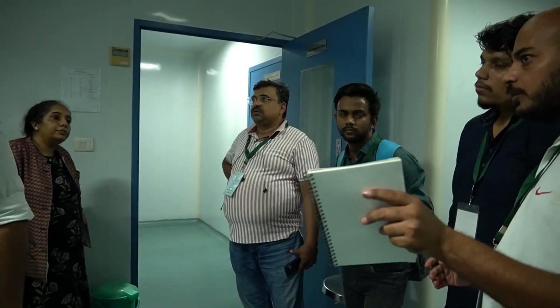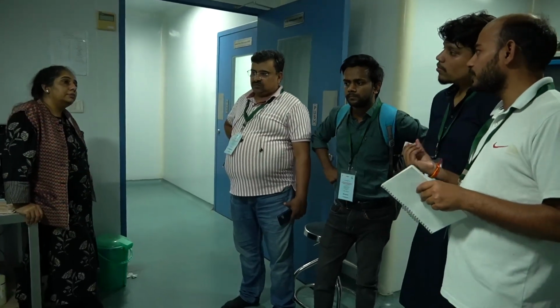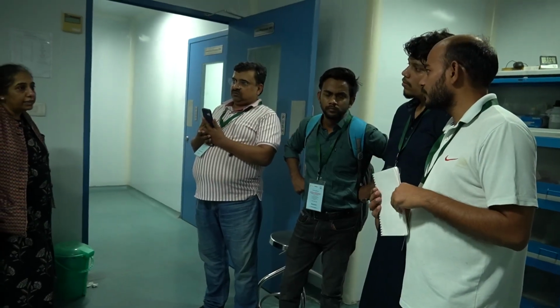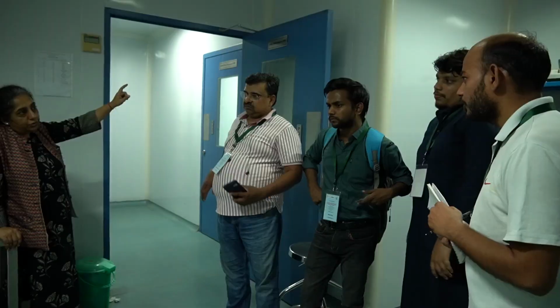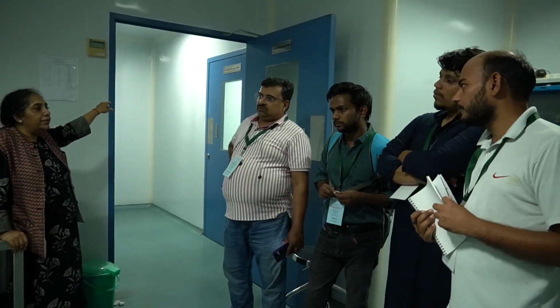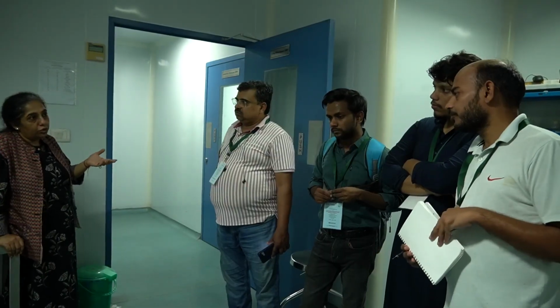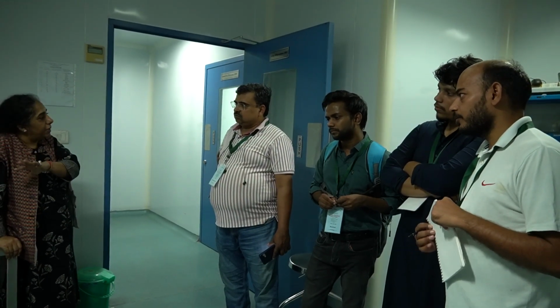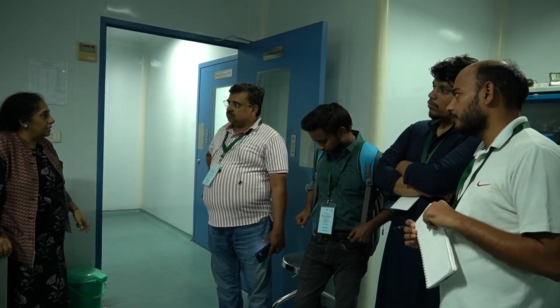After XRD, is it possible to use our sample for other analysis? Yes, because XRD is not a destructive technique. But sometimes, as you have seen in the FESEM, Nabeel mentioned that you need to do gold coating or silver coating for the sample to be conducting. So first we go for XRD, and if the sample is not conducting, then we go for gold coating and then do the FESEM.